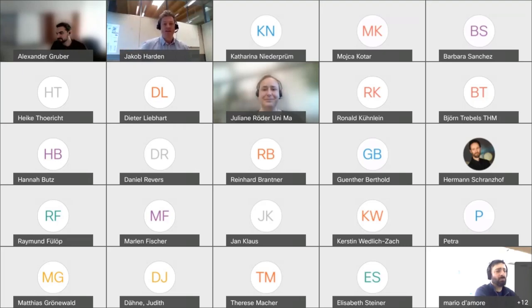That's perfectly possible. But at the moment we're prototyping, so we don't have any such feature. Senaite has this bulk operation included already, but we don't want to use Senaite because it's mainly related to chemistry labs, and that only fits one part of our needs, which is not enough. Next year we will move closer to production mode with our solution, and then this will be a topic, of course.